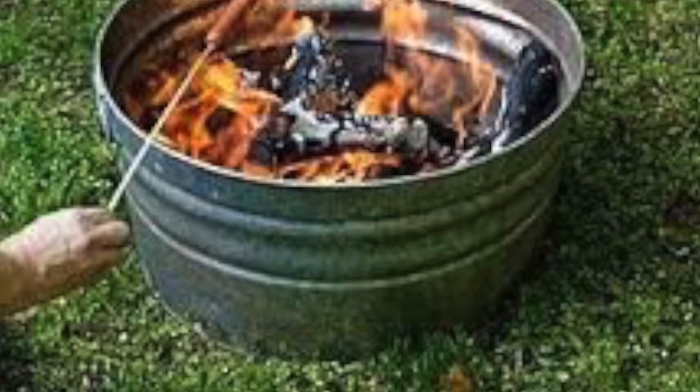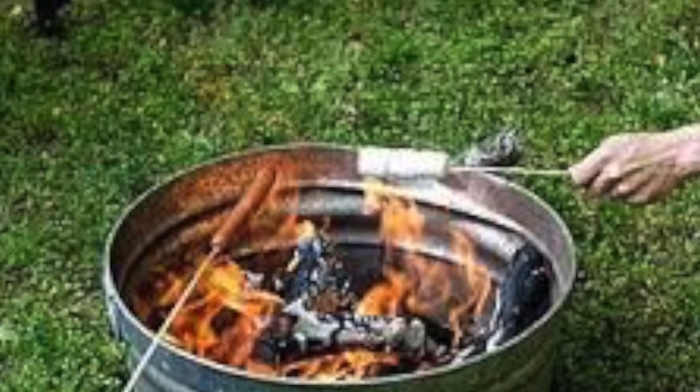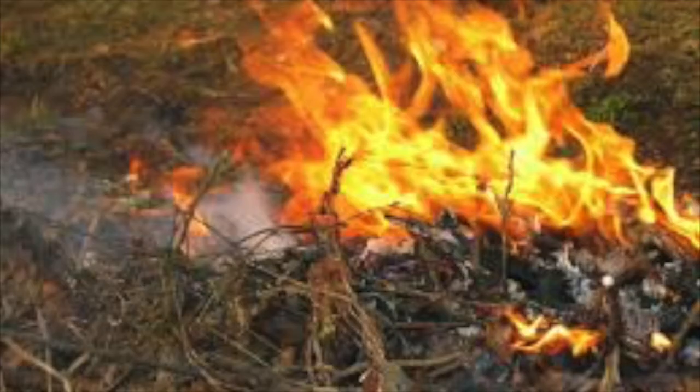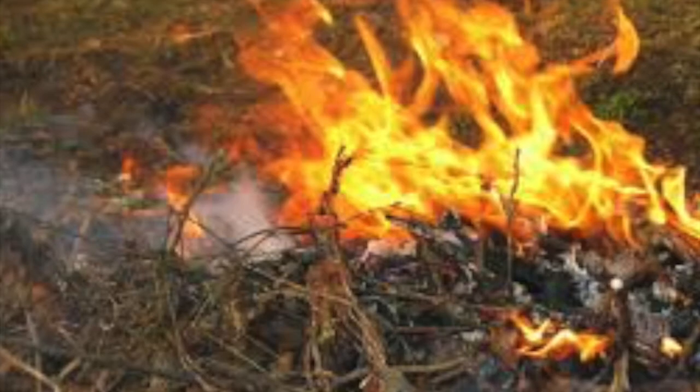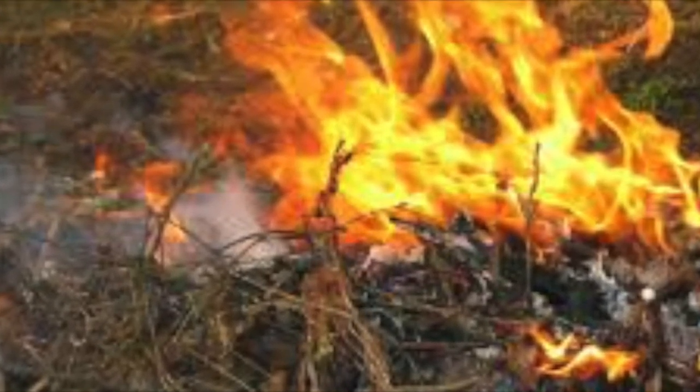If there is fire in a container, which can cause burns, you need to put a lid over it immediately. And if there's a fire on a lab bench, which can cause burns, you need to use a fire blanket in order to put out the fire. If there's an uncontrolled fire that cannot be contained by a fire blanket, you may use the fire extinguisher or evacuate and pull the fire alarm.